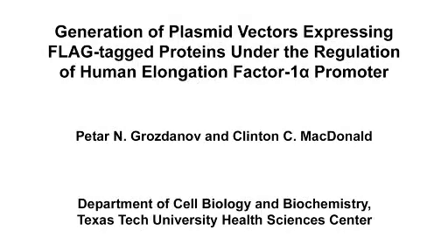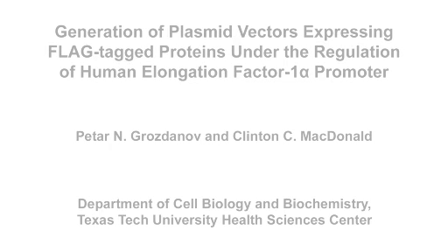The overall goal of this procedure is to use the Gibson assembly approach to create large, complex DNA constructs that combine short and long segments from several different DNA sources. First, computationally design the complete nucleotide sequence of the plasmids, and then design overlapping primer sets.